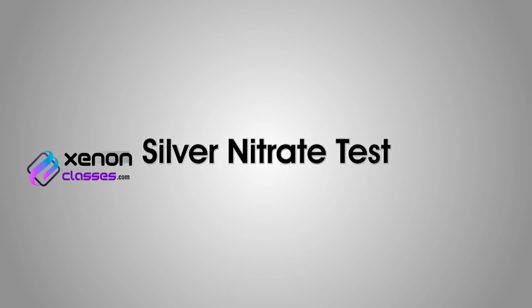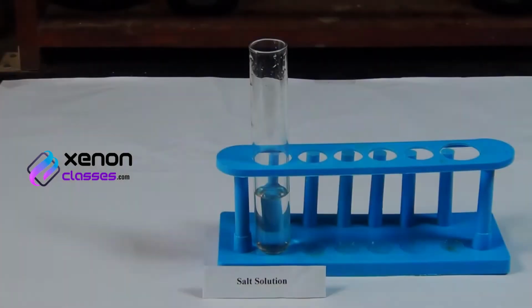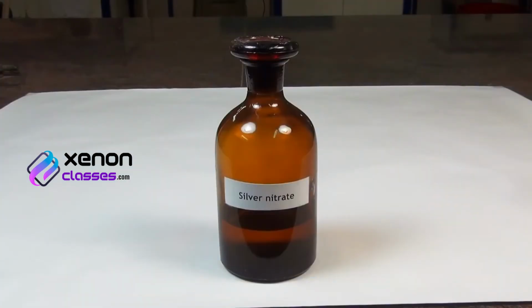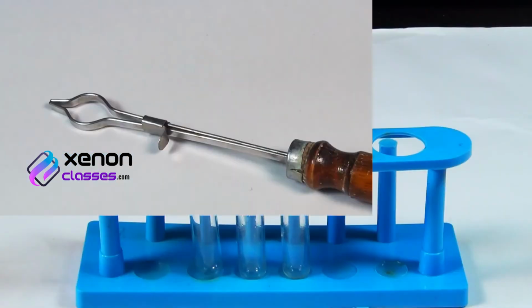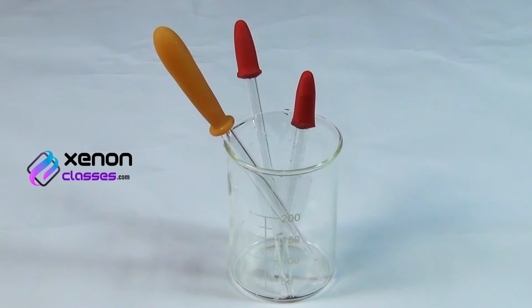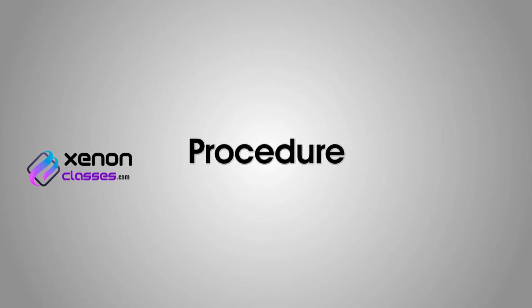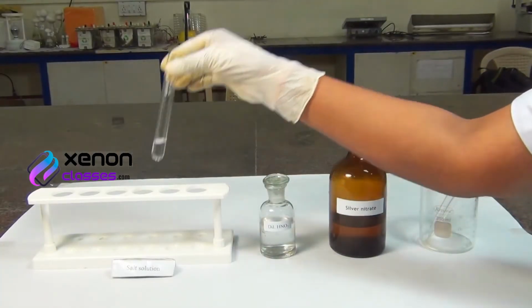Silver nitrate test. Materials required: aqueous solution of the salt, silver nitrate solution, dilute nitric acid, test tube holder, droppers, and a Bunsen burner. Procedure: take a portion of aqueous solution of the salt in the test tube.